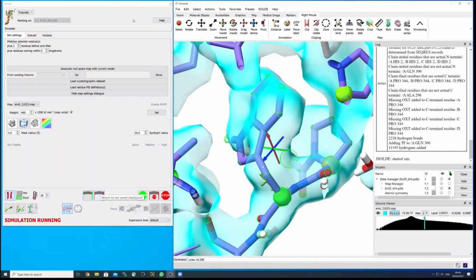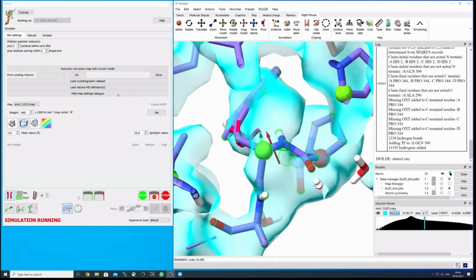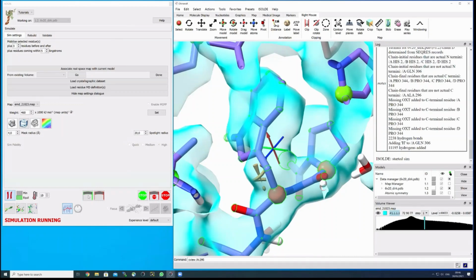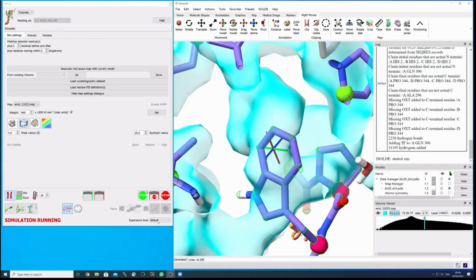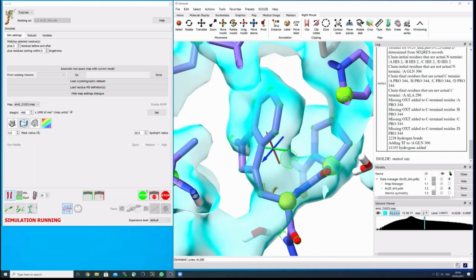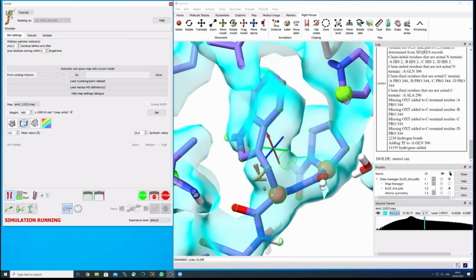For example, I now do something like this, now I generated an even bigger error, and I generate now a checkpoint because I think I'm satisfied with this. So now I have generated it. I want to change something again. Now it looks better maybe. And I go on this one here, which says return to the last saved checkpoint, and I do, and I will end up in the situation that I saved, which is not good, but this is just a functionality.